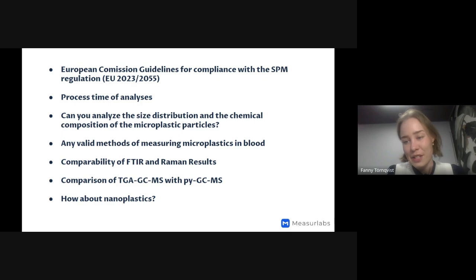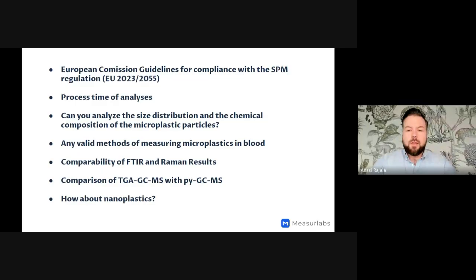Where do the analyses take place? In my understanding, you use partner laboratories for microplastic analysis. Do you then use different laboratories or only one? Yes, we do use different laboratories because different laboratories have different techniques and are specialized for different kinds of matrices. We have a couple of laboratories in the EU, a couple of laboratories in the US, and also one in Asia that we work with.